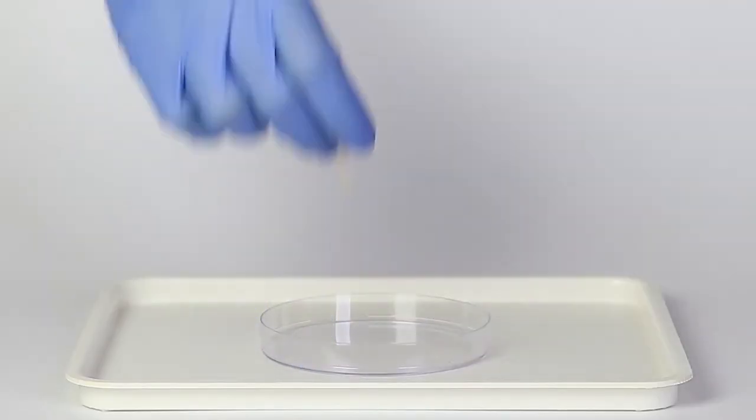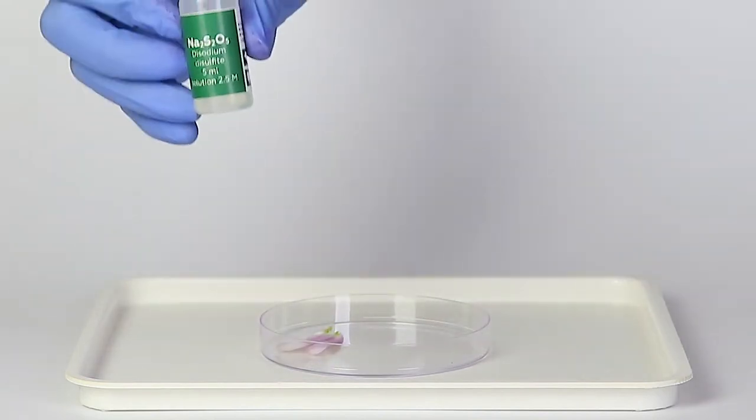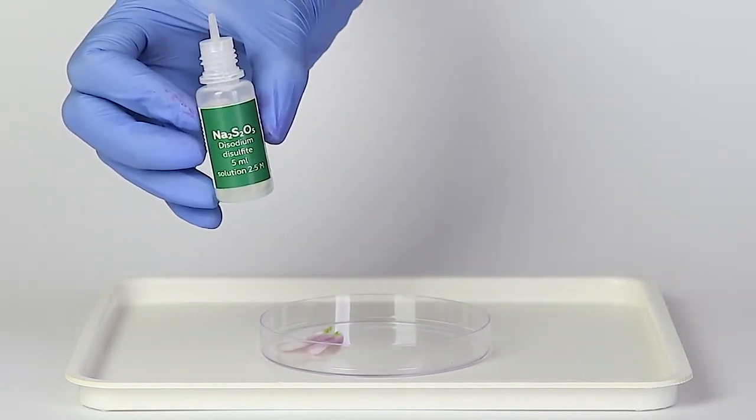Put some petals into the petri dish. Next, drip 10 to 15 drops of sodium pyrosulfite into the petri dish.